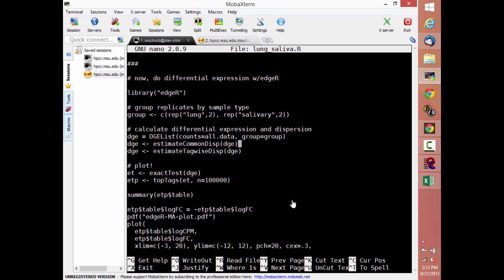It works out well. All of that to say, there are really 2 different kinds of analysis that you can do using EdgeR. There are very few reasons not to do the DGE style, which is short for, unsurprisingly, differential gene expression. Differential gene expression expects 2 conditions.